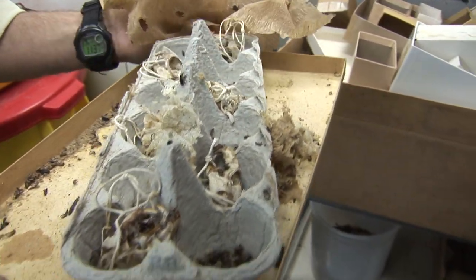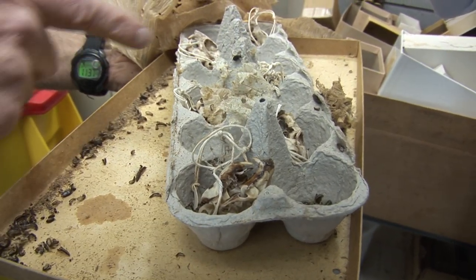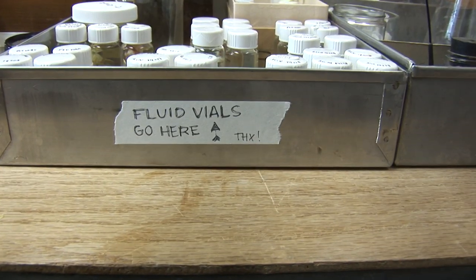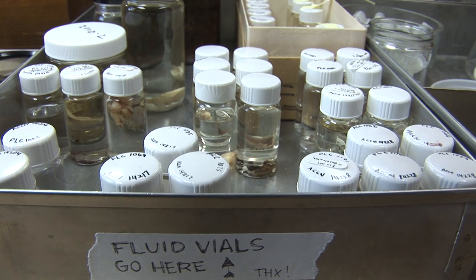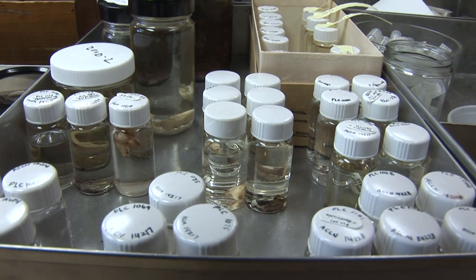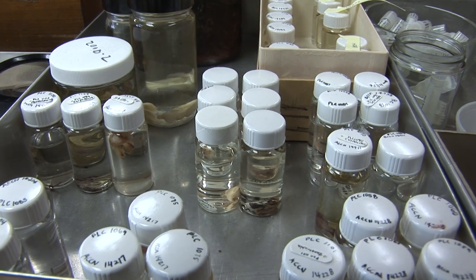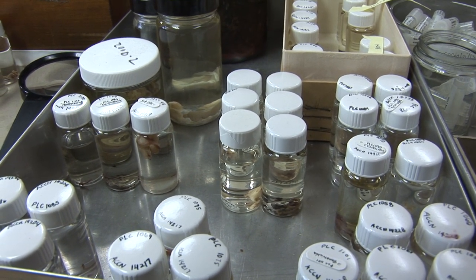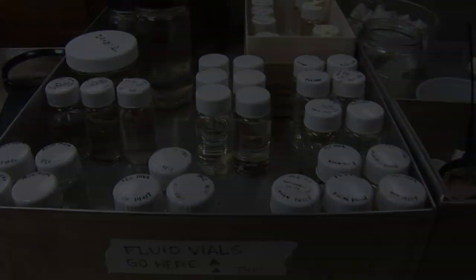If the bugs are really hungry, it can take as little as 24 hours for a small specimen. They come out from the bugs, get soaked, and residual pieces of fat, gristle, or cartilage that the bugs don't remove are picked off by hand. Then, depending on the size of the animal, they get soaked in an ammonia bath or a fat solvent bath to remove as much fat from the bones as possible.